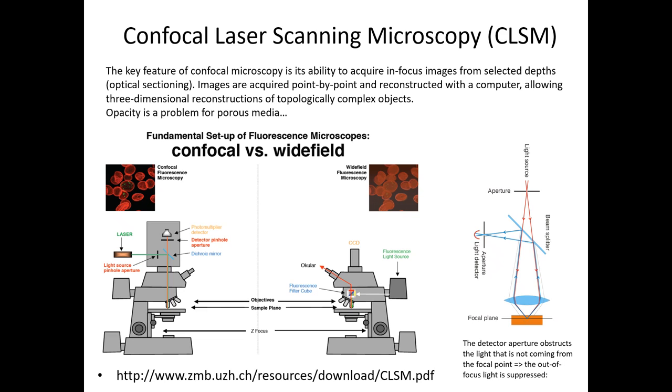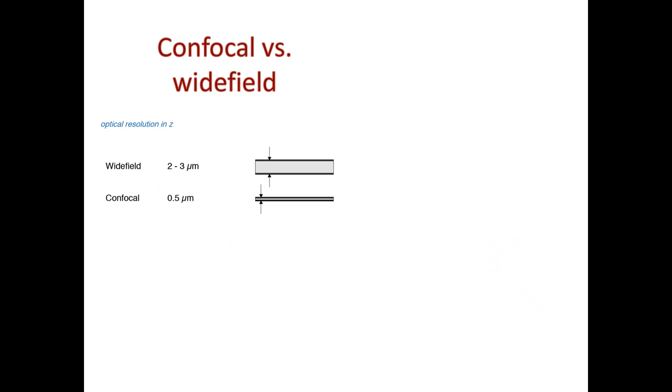So wherever you see the plane, it will be there, but you will see it a little bit from below as well. So it's hard to say, like, oh, this is precisely the plane you focus on. What you focus on is definitely the sharpness, but there's always a little bit of information from above and below. And that can be confusing.